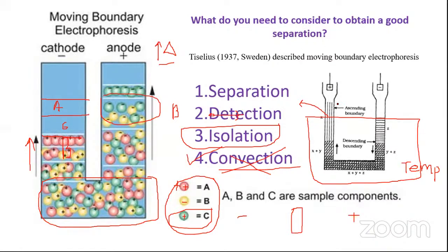If I put a pipette over here and try to aspirate it, I will be aspirating all this stuff, because once I stop the electric current, this will be brought back to the same situation. The molecules will again try to diffuse. Diffusion, you know, the process: it is the movement of solute molecules from a region of high concentration to a region of low concentration. Now, do you agree that X is highly concentrated in this area?